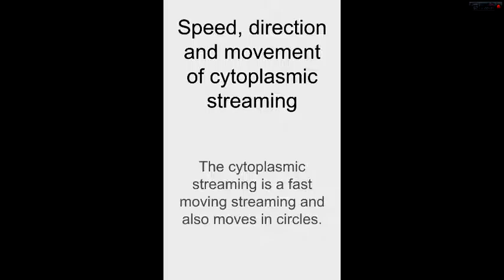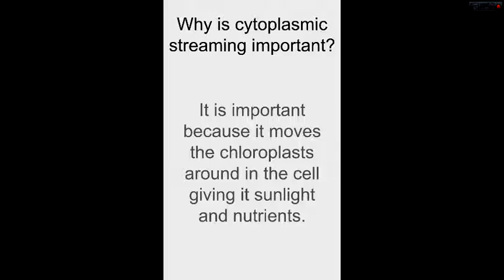The speed, direction, and movement of the cytoplasmic streaming: the cytoplasmic streaming is a fast-moving streaming and also moves in circles.